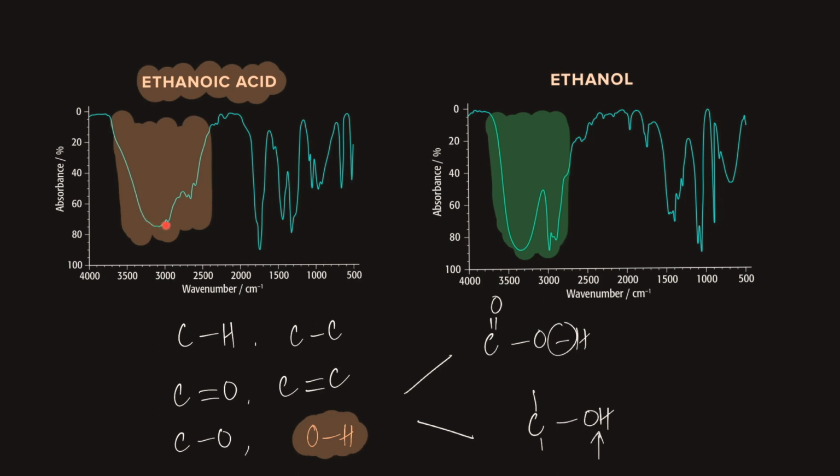This reminds me of an upside down iceberg. So in my head, I'm always thinking, oh, it's an iceberg peak, and that belongs specifically to a carboxylic acid. Not just ethanoic acid, it's specifically for a carboxylic acid. It's ethanoic acid because this belongs to a 2-carbon molecule, so we can deduce it's ethanoic. Over here, this is ethanol with just this characteristic lobe-like peak. And it's called a peak. It's definitely a dip, but it's called a peak anyway. Don't let the word confuse you too much.